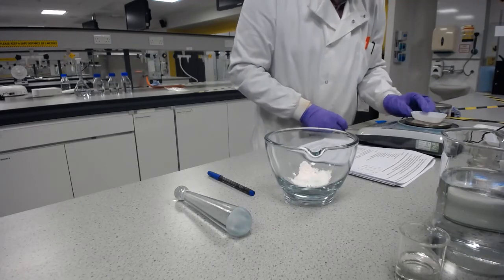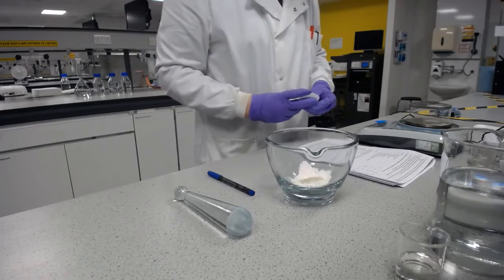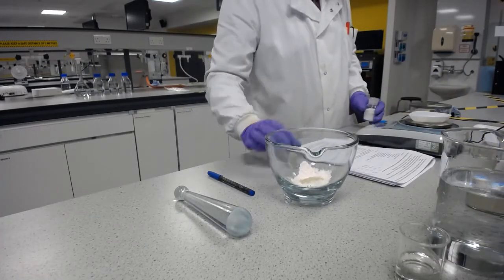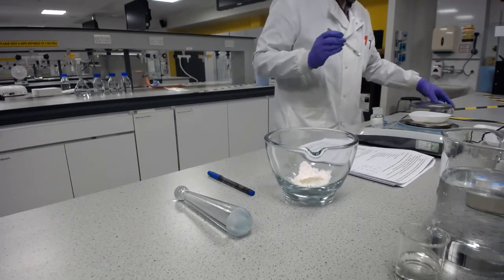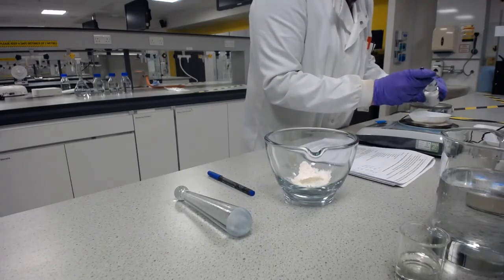There we are. That's 1.5 grams of bentonite. And then 0.25 grams, so 250 milligrams of trisodium citrate. So much smaller amounts of this, so I'll be much more cautious in how much I put in.